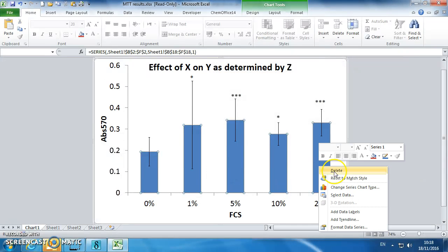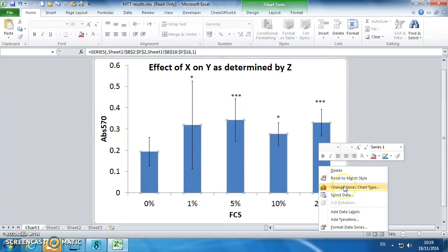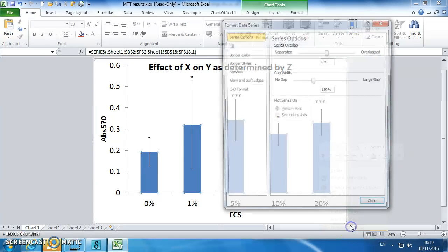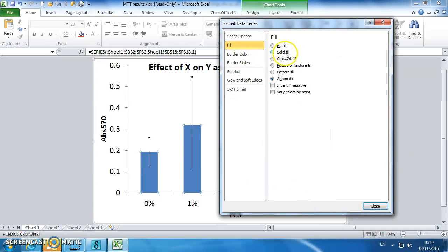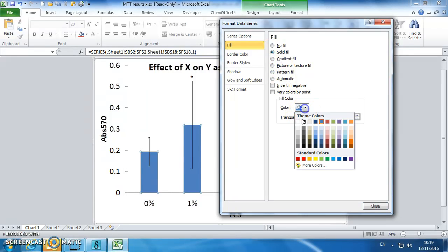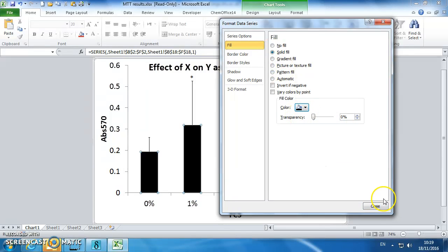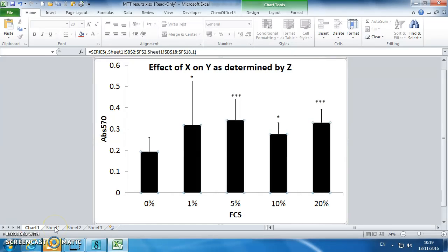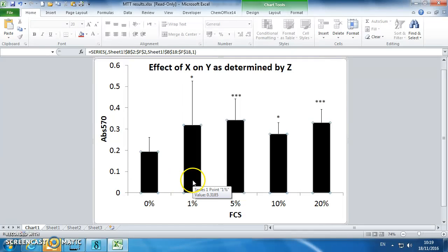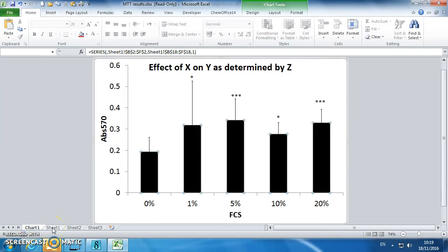I want to select format data series, fill, and make it nice and black, just my personal preference. So you've now got a pretty nice looking graph. The sorts of graphs that you want to do would be a graph like this for your MTT data.